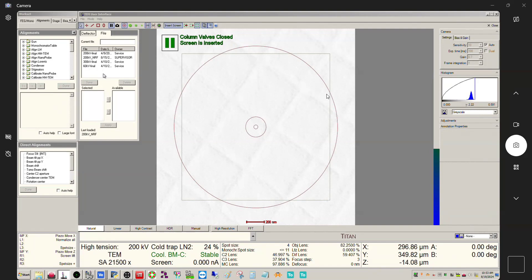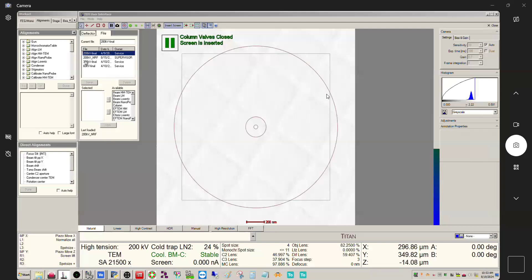The files that are done at the service level cannot be overwritten and they cannot be deleted. If I wanted to, they say I can't delete this. What I can do if I want is I can save this as another file and then modify that version, which is exactly what I did when I built this 200kV underscore nrf.